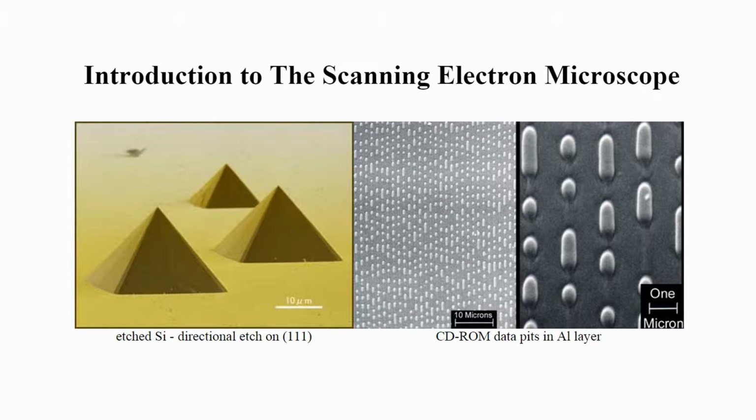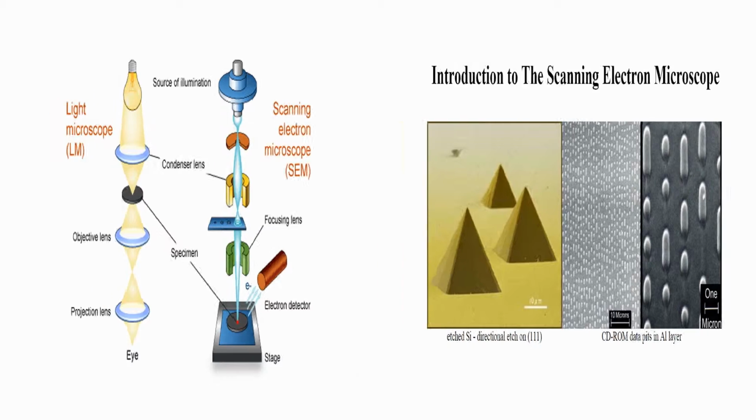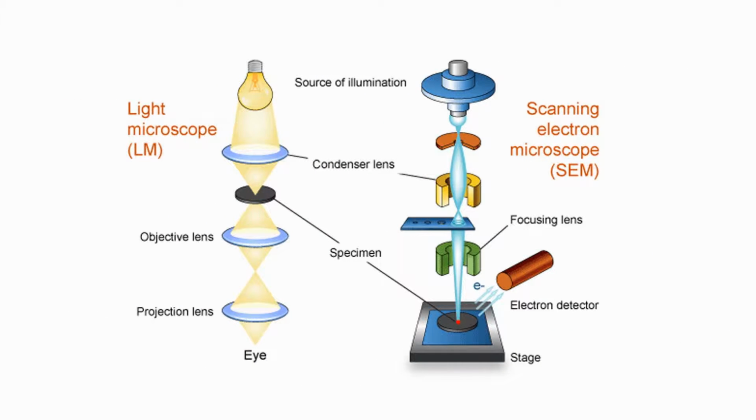Today we are going to learn some basic knowledge about SEM. And this picture is taken by SEM. This is a diagram comparing an optical microscope to an SEM.